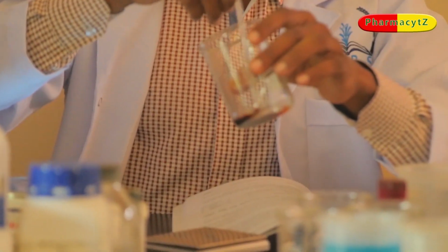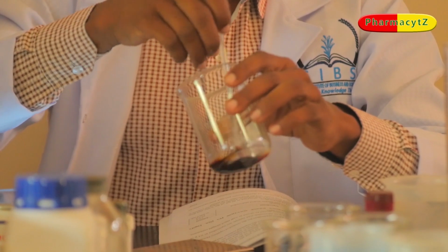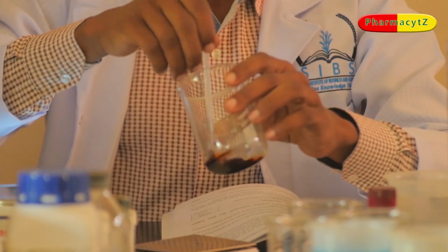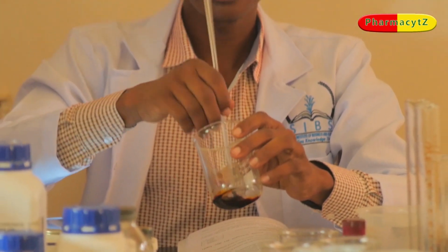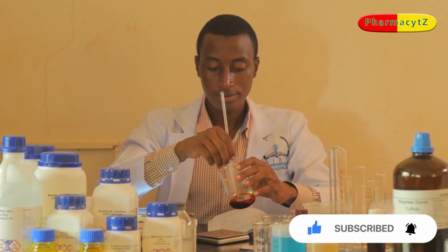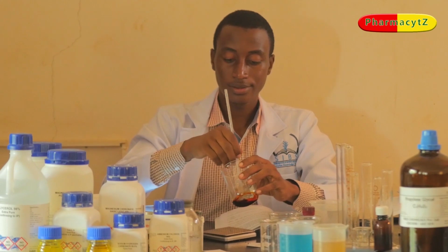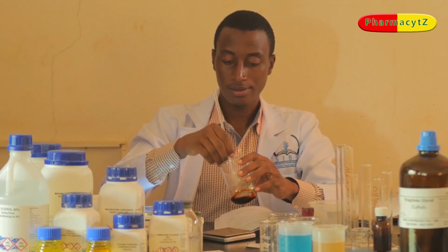You can see it started dissolving before I started stirring. You can see now it's dissolving completely in this solution. Iodine crystals are dissolving completely in this solution. You stir until it has dissolved completely. Now the product has dissolved fully.